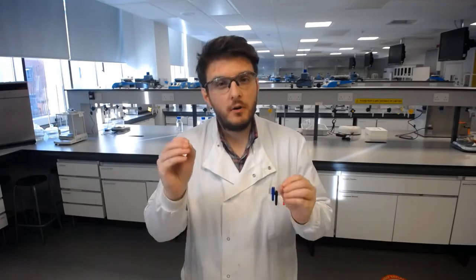And so what we may do is we may accept that that's going to happen and then say, all right, we're going to put something in there that means when it does separate out, those particles aren't going to get too close to each other. They're going to stay far enough apart with enough water between them that when I shake that formulation, it will redisperse very quickly and easily. And those things that we put in are called flocculating agents. And again, it goes through this in the script as well for you, but there's two main types of flocculating agent that we may use.